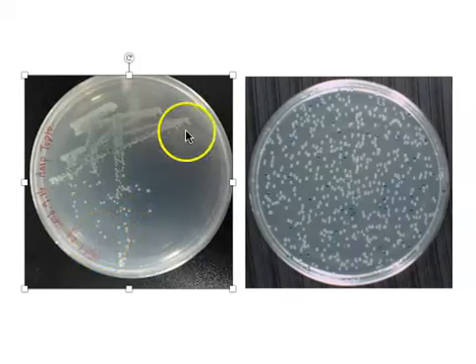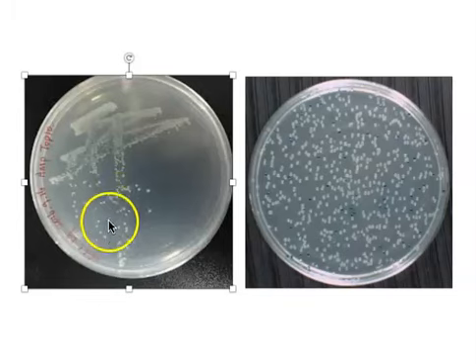We make quadrant streak plates when we want to evaluate what's called the morphology of a colony. All that word morphology means is body form. We can look at a colony and we can evaluate its appearance and its size. And that can tell us something about what kind of a bacterium or even a fungus produced it.